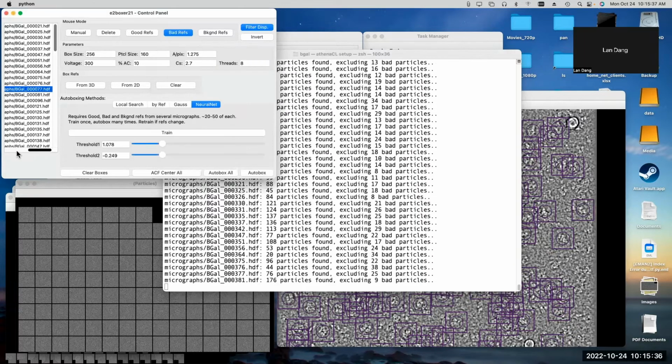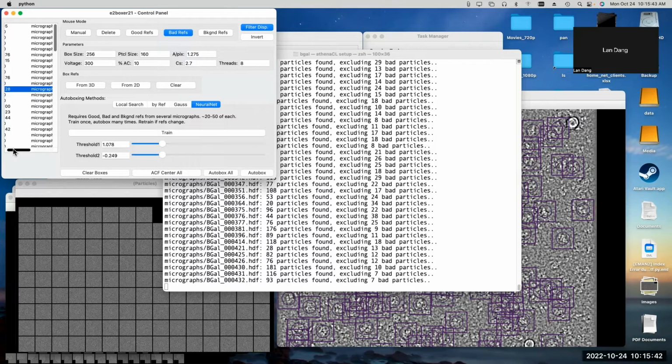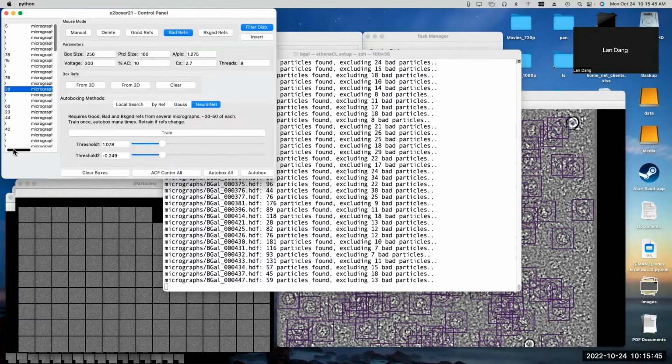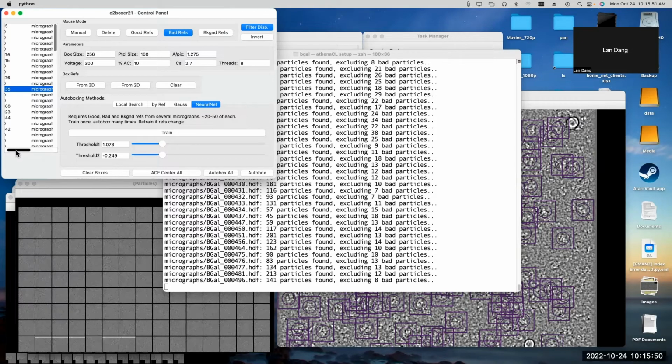Actually, I have a question. Yep. So, can you evaluate the performance of the network based on the train out file? Like when you're done training a network, there will be two train out files being output. You want to check the fidelity of the network to see if it matches the input training data. Yes. So you could do that, but we don't have a tool for doing that. Actually, I'm kind of confused because I do it on my own data set. The training out set for the background versus particles kind of makes sense, but the others always give me some weird things.